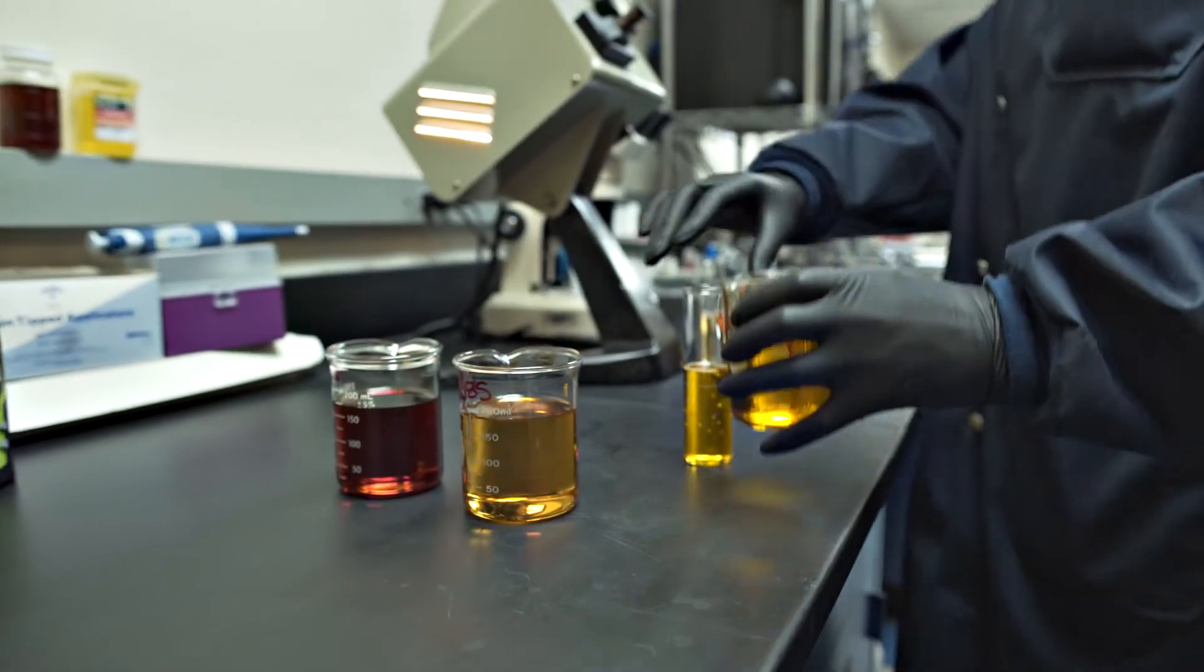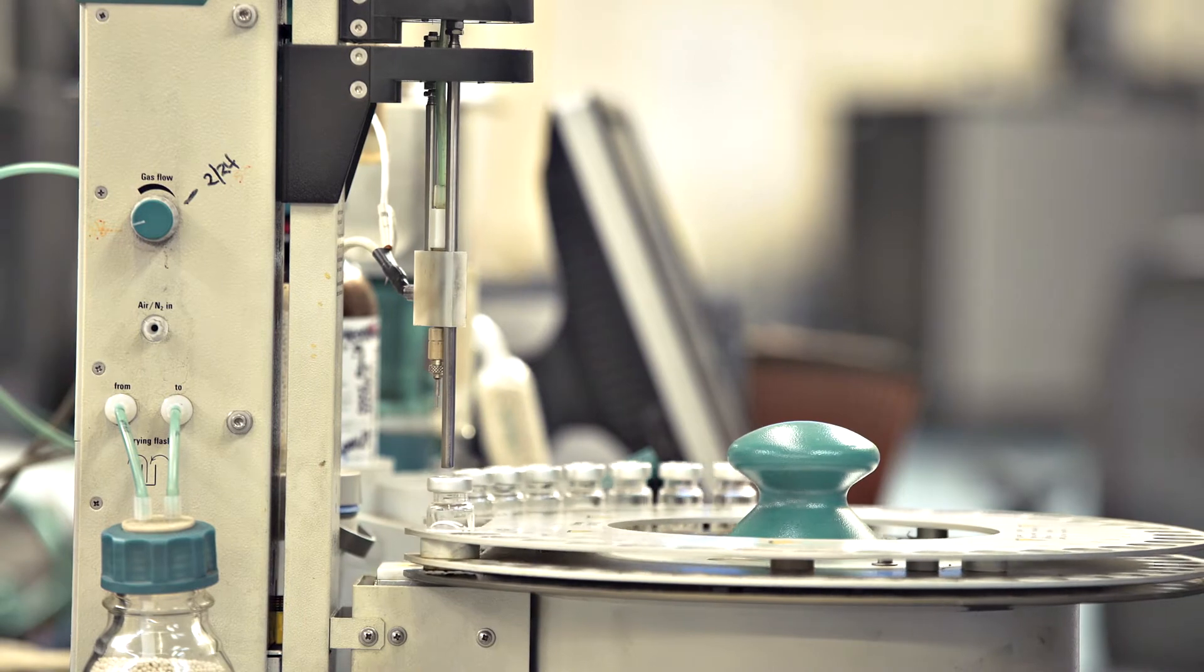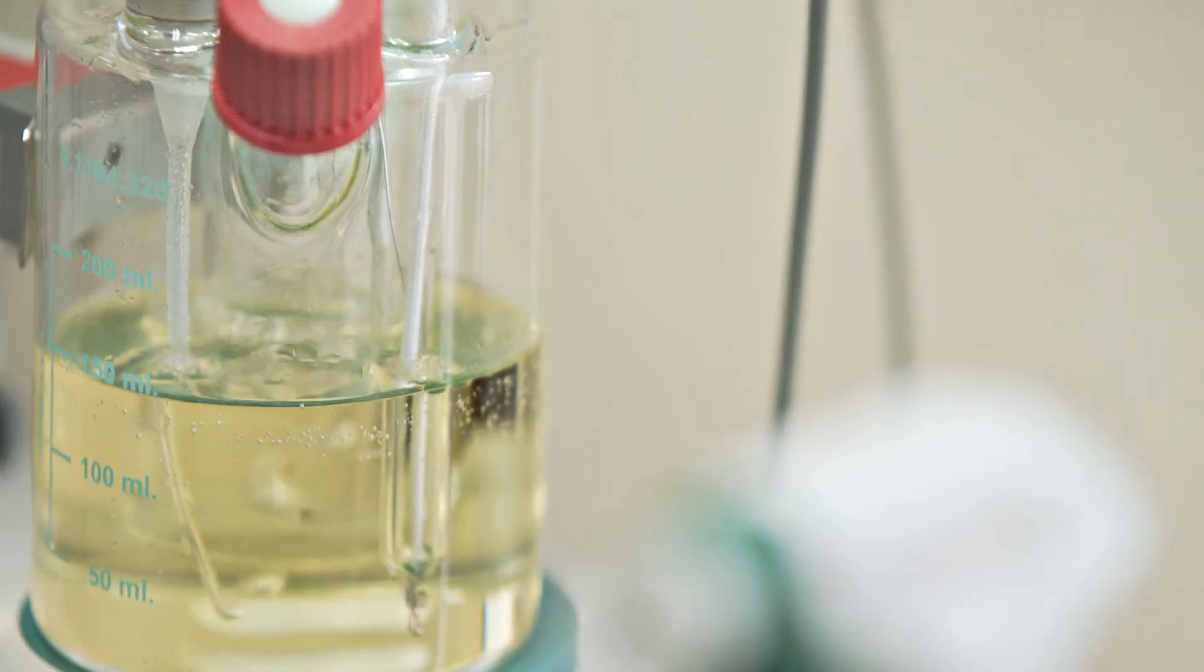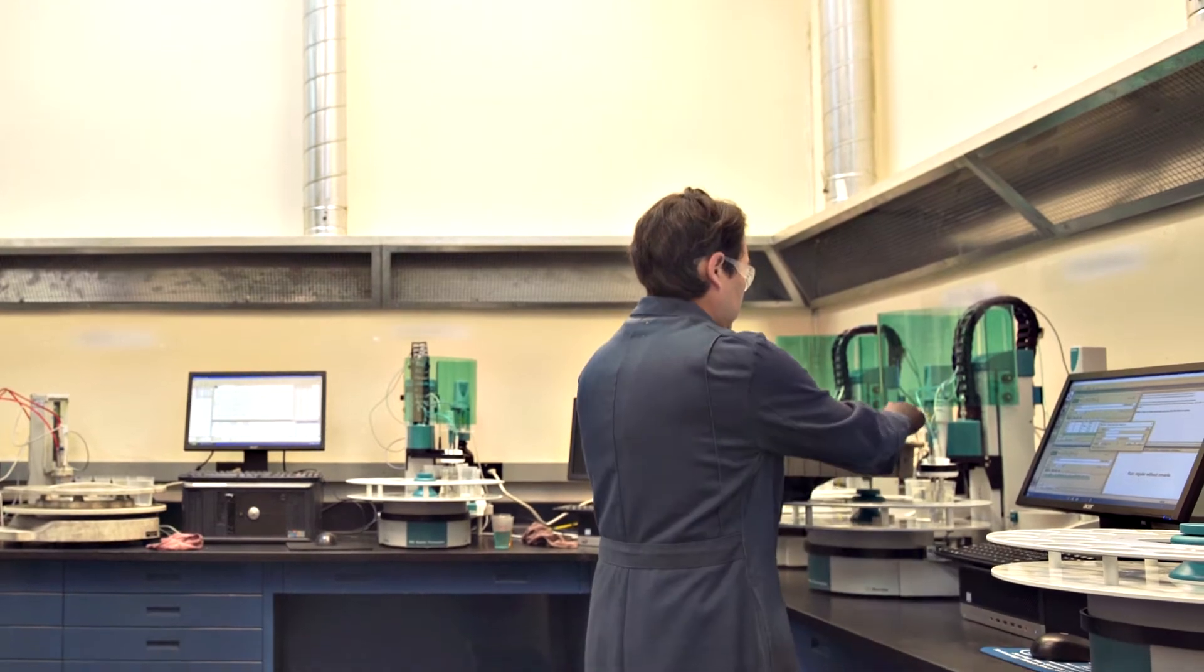These routine test parameters are used in various combinations to constitute ALS turbine oil test packages that are used for routine, quarterly, and annual monitoring of turbine oil circulating systems.